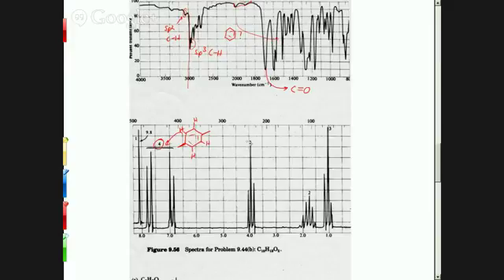This one has 2 hydrogens in it. So that's probably what? A CH2. And we know that a CH2 connects on 2 sides, right? Needs 2 more bonds. So that gives us one more piece. Similarly, we might say that this is probably a CH2. And this one is probably a CH3, which has one connection.